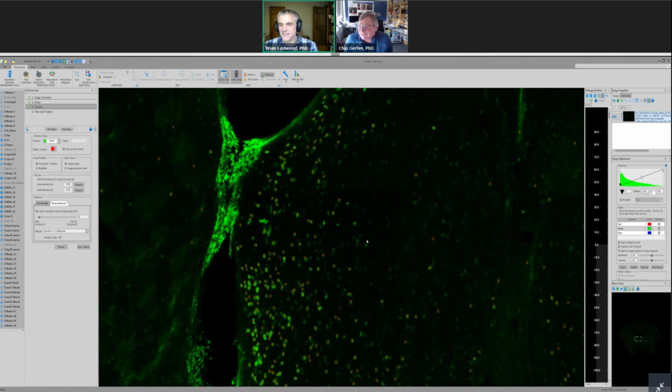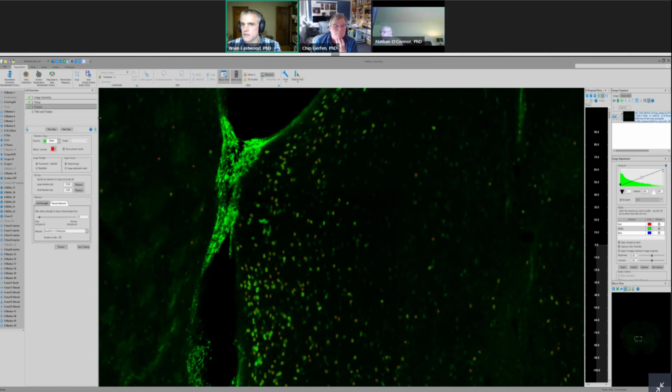Right. And presumably the idea is that as we show it more and more examples, like we did with the pyramidal case, it will get even better, right? Yes, that's exactly right. That's where we are right now with c-fos, where it's active research. I think we're making some really great improvements, and we're looking to expand the types of data that we see as well. We're incorporating information and more examples from different labs to try to make this a more robust network.